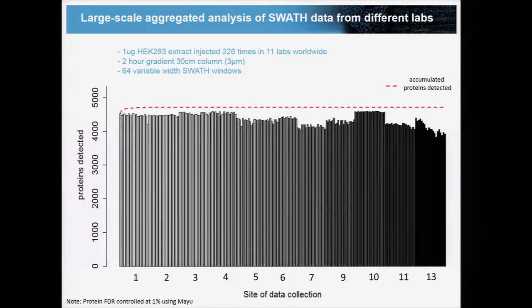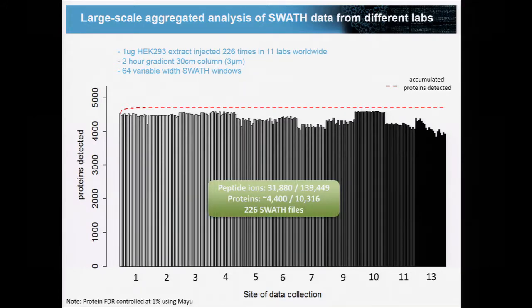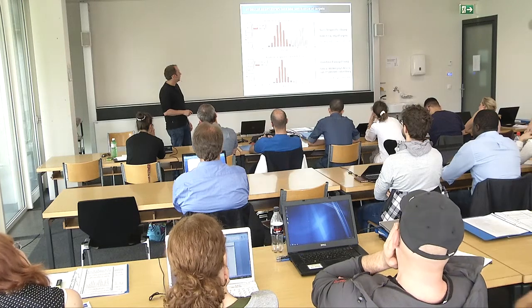So this is now all 5600 data. The chromatography was fairly similar, but it seems like it's basically this portability question. There are good indications that people can use these libraries that we create here, or other people create. They could be disseminated. So this is what I told you already yesterday.